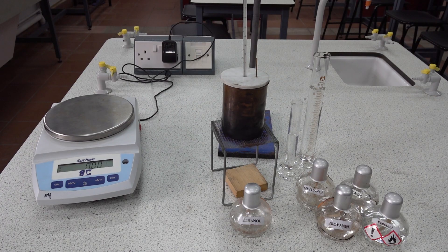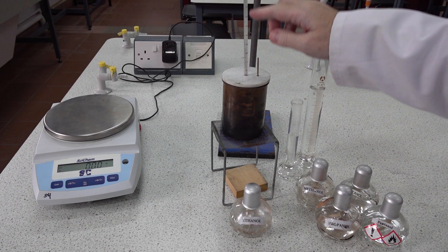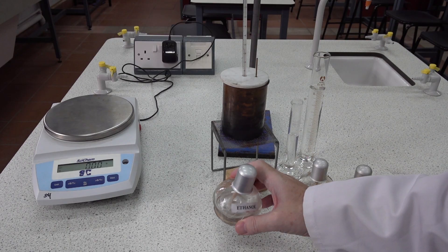For this simple calorimetry experiment looking at the combustion of alcohols, we have a copper calorimeter, a lid and a stirrer, a 0 to 100 degree centigrade thermometer, and a spirit burner containing ethanol.